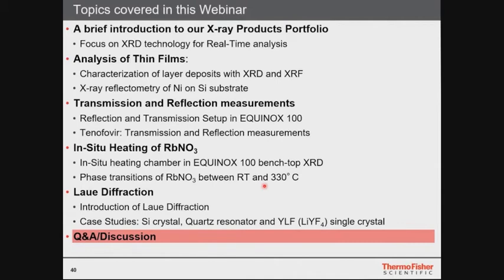There is always a limit of detection, and this is very specifically different for each sample. So in principle, the best thing is to just do test measurements and see if we can satisfy the need with our instruments. But in principle, something like this is possible.